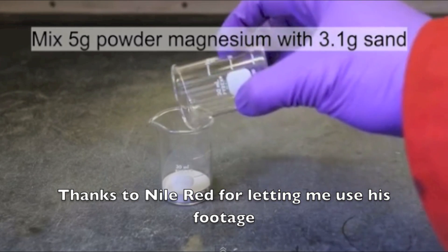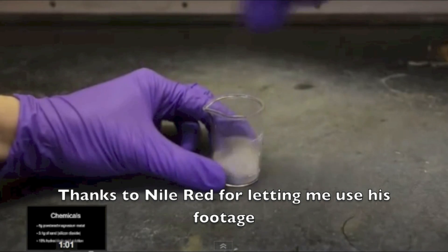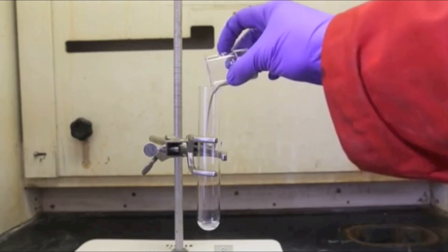In his video, Niall Redd synthesizes magnesium silicide by heating together silicon dioxide, or sand, and magnesium metal in a test tube.